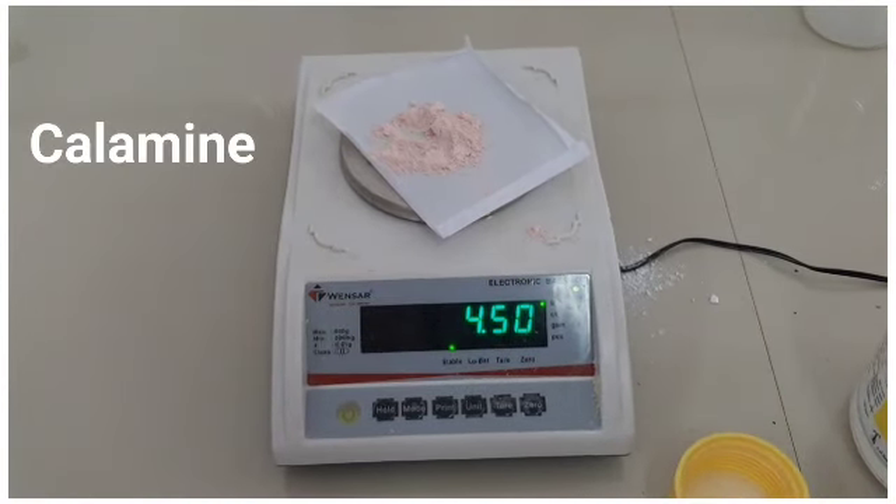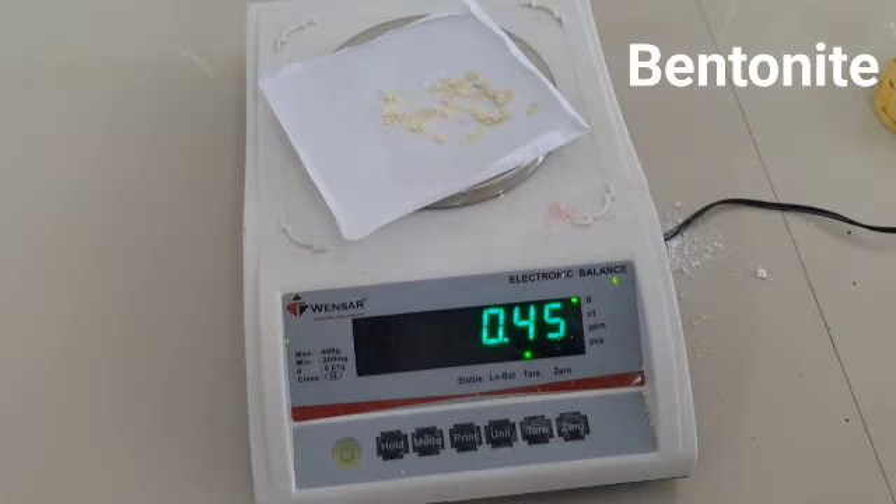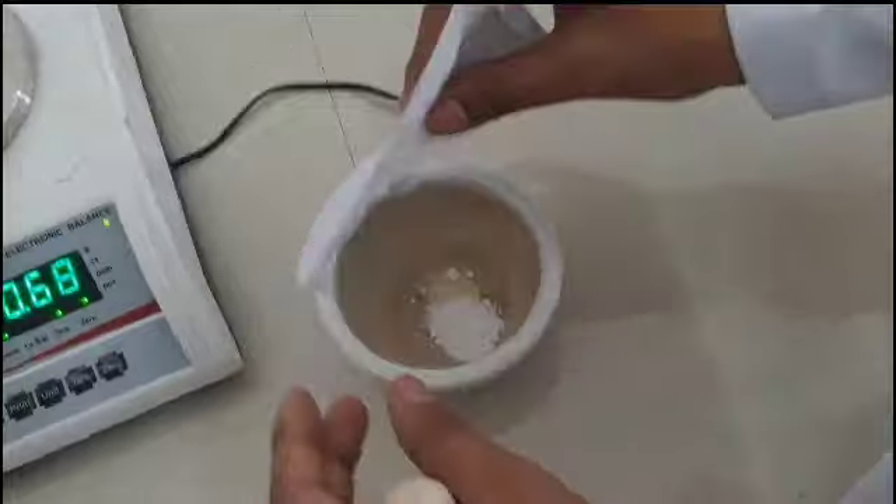For the procedure, take 4.5 grams of calamine, 1.5 grams of zinc oxide, and 0.45 grams of bentonite in a mortar and mix them well.